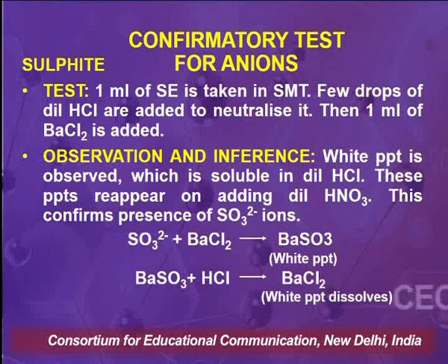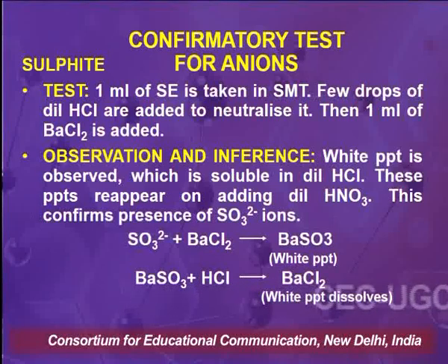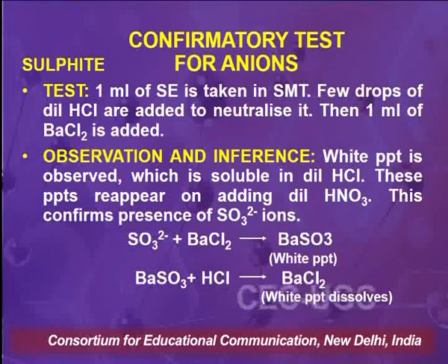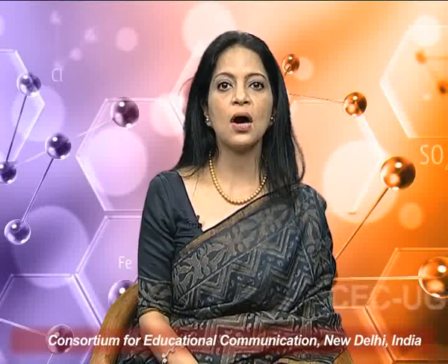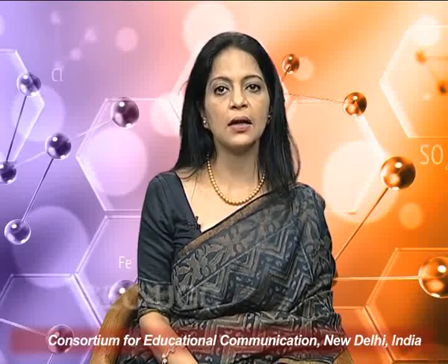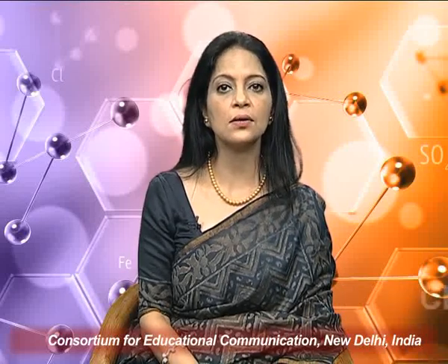The acid which is chosen for neutralization is in accordance with the common ion of the reagent which has to be further added. For example, in this case barium chloride is added and the acid chosen to neutralize the soda extract is dilute HCl, since chloride is common to both HCl and barium chloride. The observation is white precipitates which are soluble in dilute HCl. These precipitates reappear on adding dilute nitric acid, and this confirms the presence of sulfite ions in the mixture.